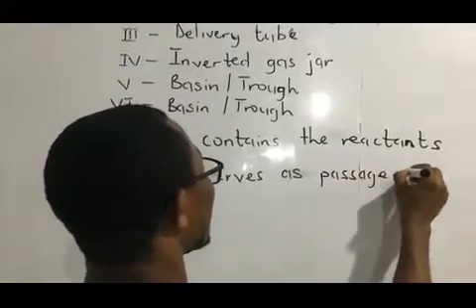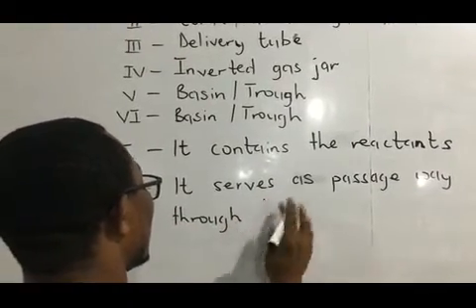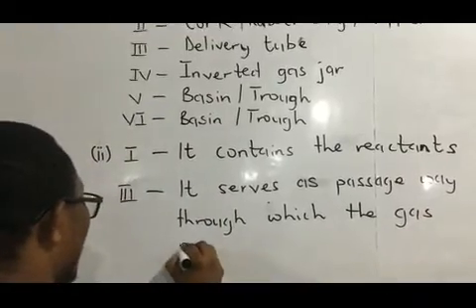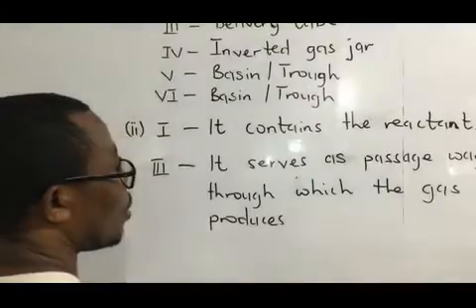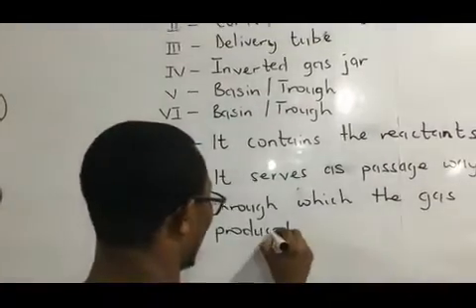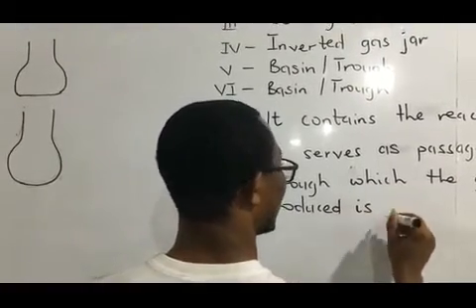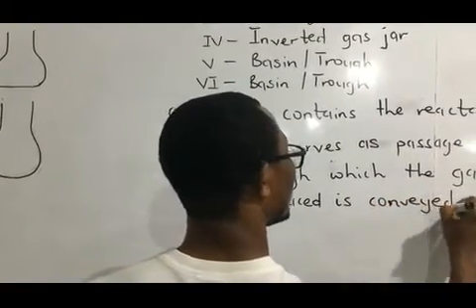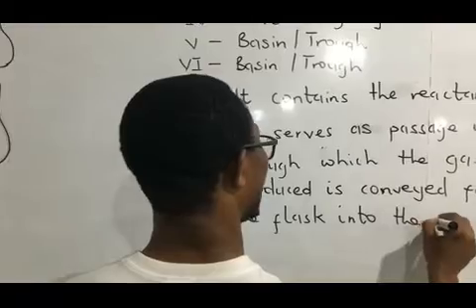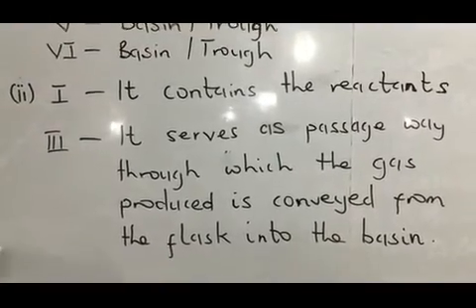It serves as a passageway through which the gas produced is conveyed from the flask into the basin.